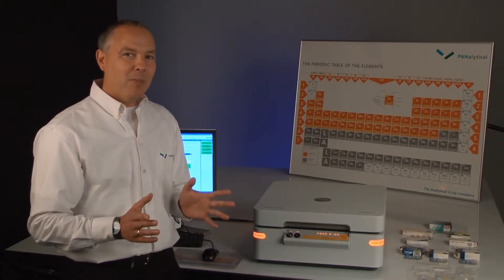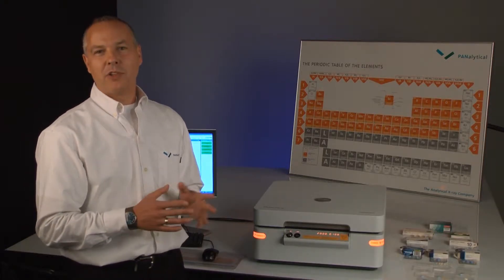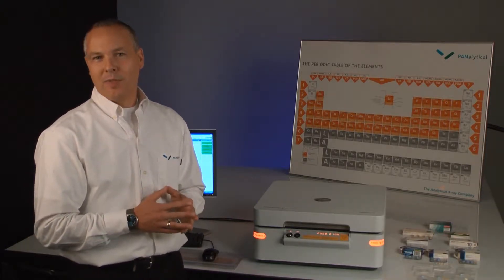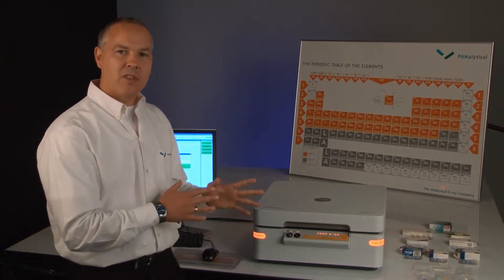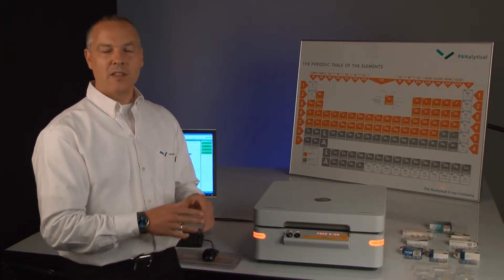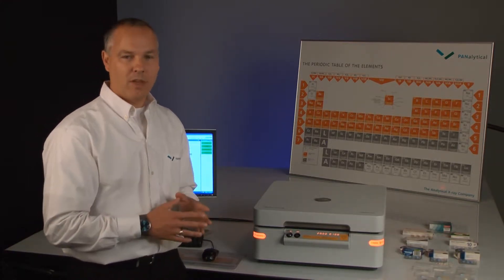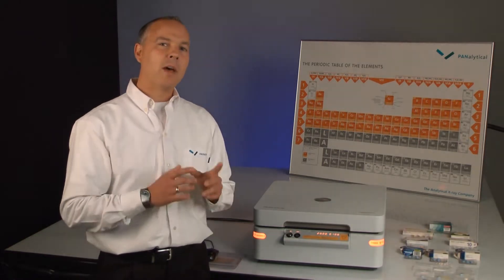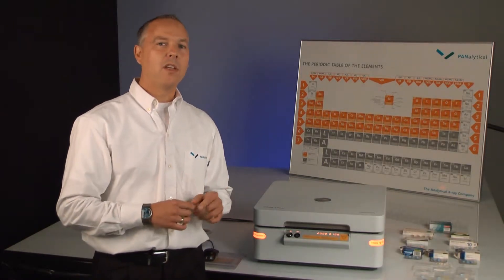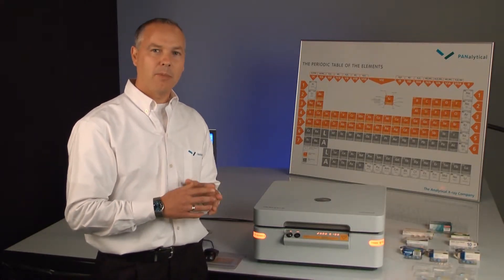Hi, I'm Ian Campbell, a product manager at Panalytical. The most common use of the X-ray fluorescence technique is elemental quantification. One example is metal impurities in pharmaceutical tablets.